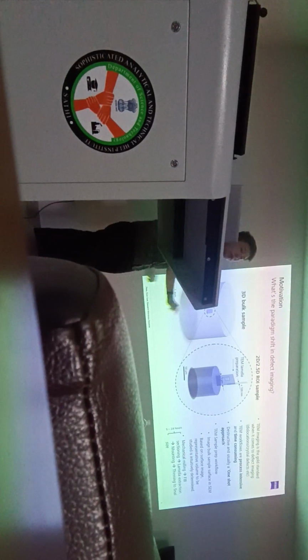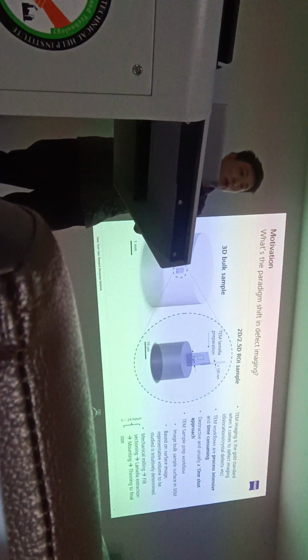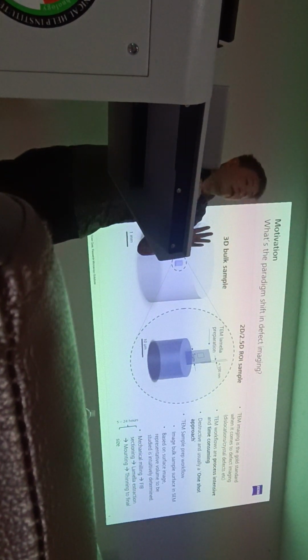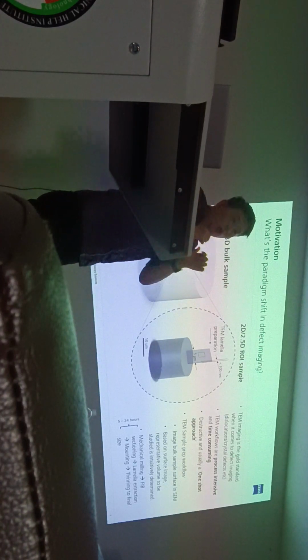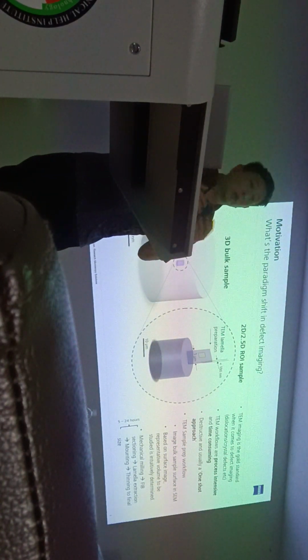Today just lined up very nicely. We talk about EBSD, we talk about all the crystallographic 101, and this is just the application, right? So let's suppose you have 3D bulk materials, and you want to see the defects and all that. Before this technique, people would cut the material with the FIB, the focused ion beam, right? And when we cut a very small piece, we put it under the TEM, then we can look at the diffraction pattern and so on and so forth.